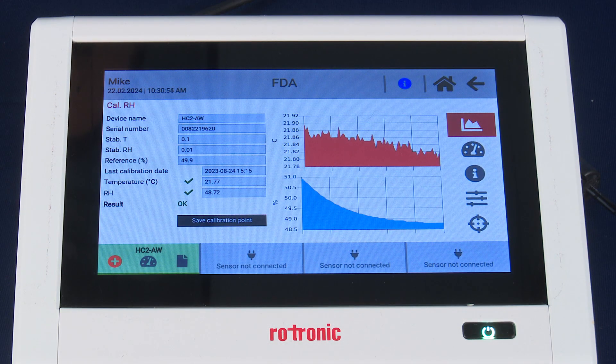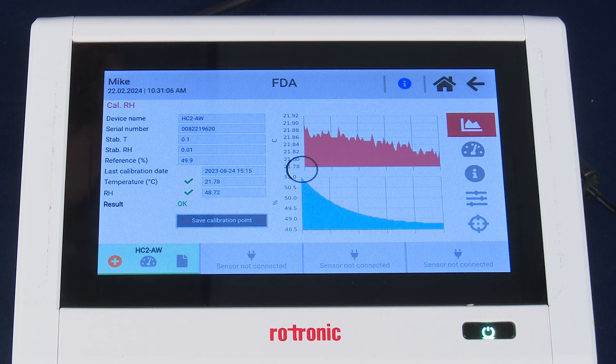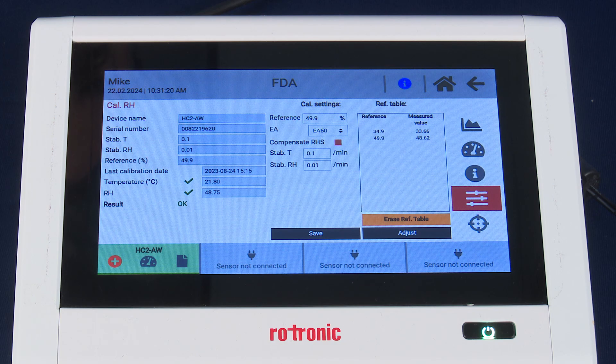Our second measurement point at 50% RH has completed, as evident by the OK icon next to the result. We want to go ahead and save that calibration point. As you can see in the reference table now, it indicates both of our measurement points — the 35 and the 50% RH.